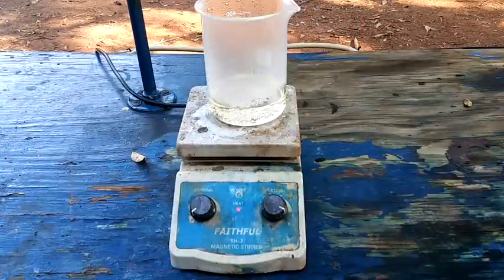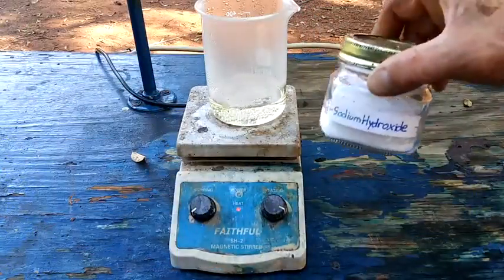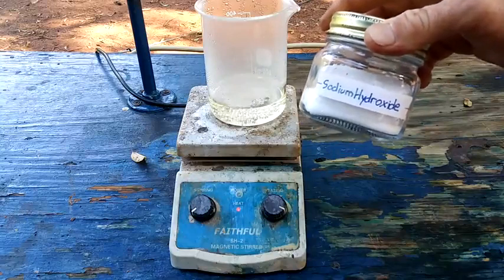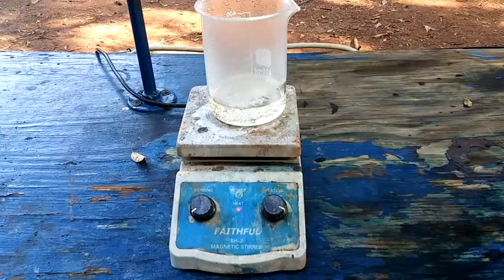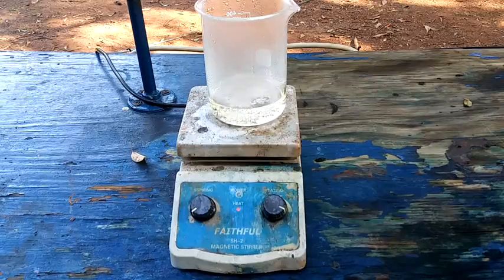So, we're moving on to our next step here, which is going to be to neutralize this with some solid sodium hydroxide. Obviously, this thing is boiling. Adding in sodium hydroxide, it is going to react extremely vigorously. This part is potentially very dangerous. So, another obligatory, don't try this at home.